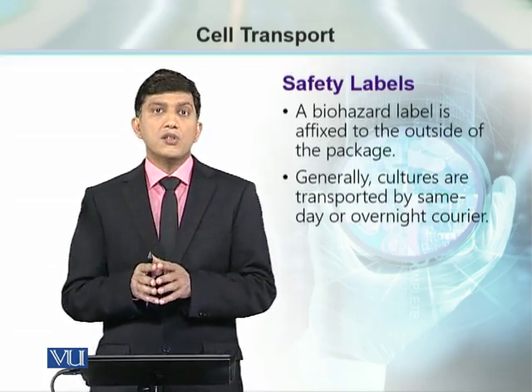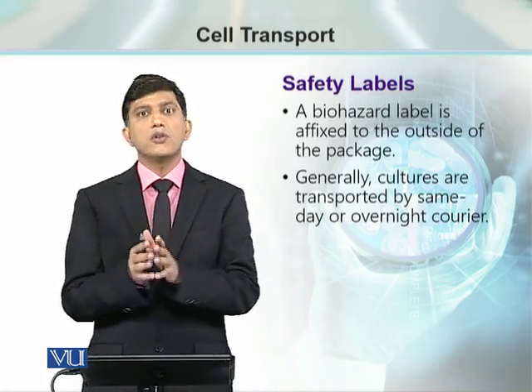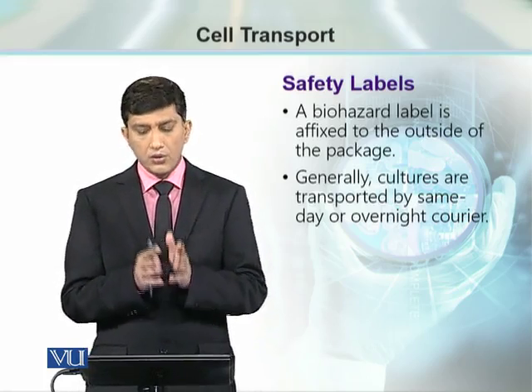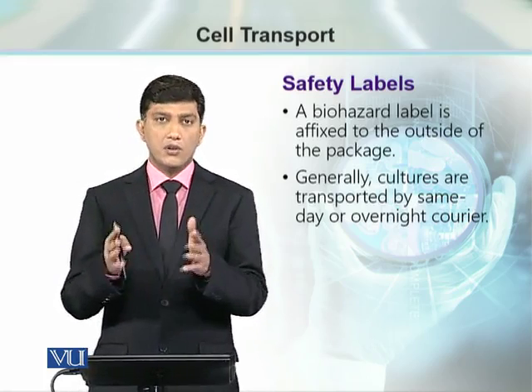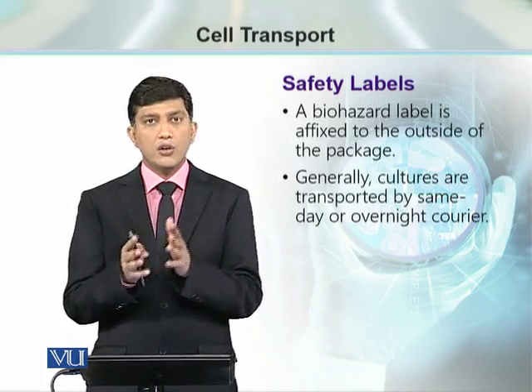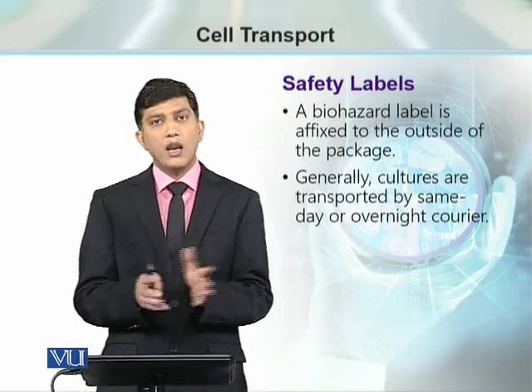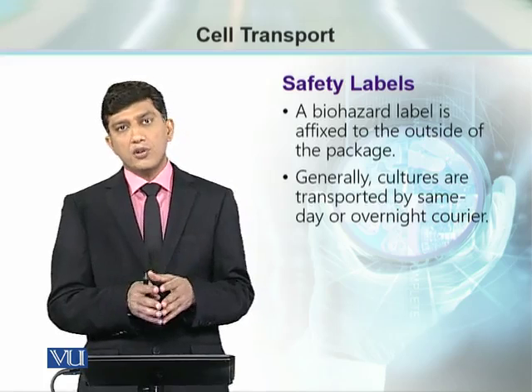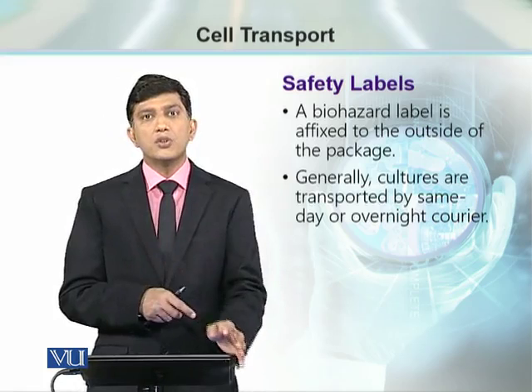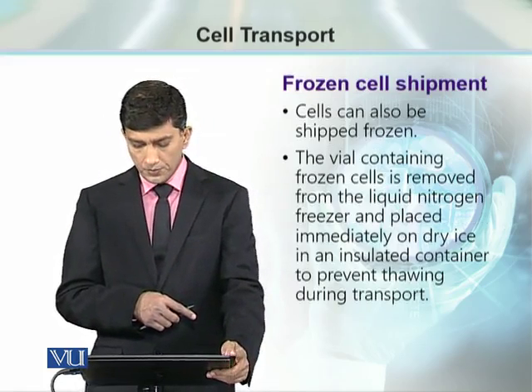सबसे ज़्यादा ज़रूरी चीज़ जो labels हैं, that the packet, the box or the parcel should carry a clear cut label of biohazard material, because living cells हैं, they can be biohazard level उनका हो सकता है. So we need to label them so that the people who are handling these boxes during the transportation, they should know to take all those measures which are required for handling a biohazard box or material.